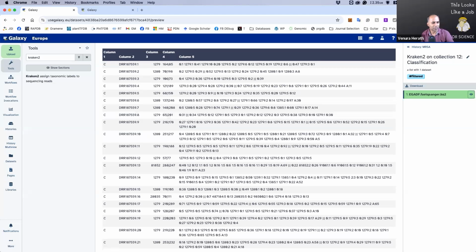So others, can we move forward? Those who are still waiting for the results, did you get your result?